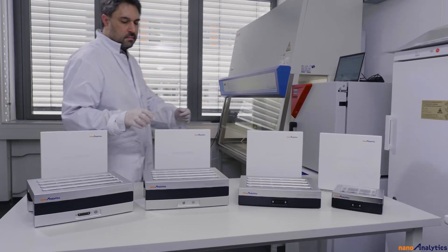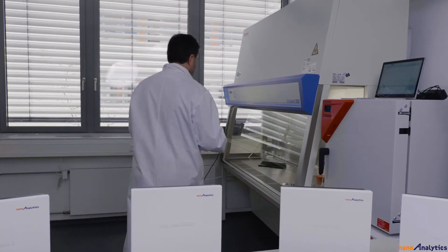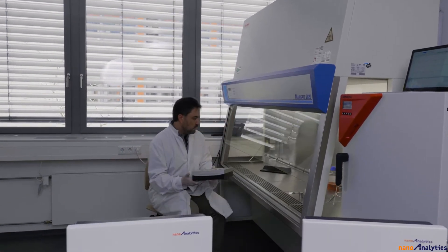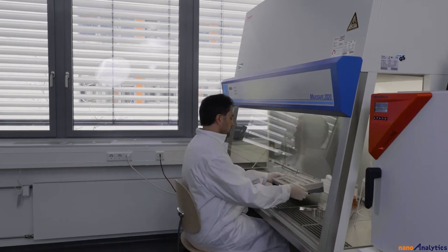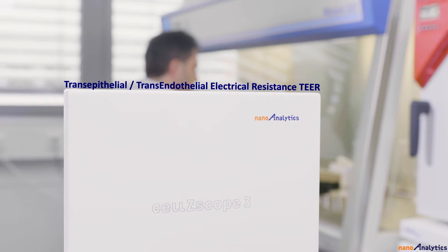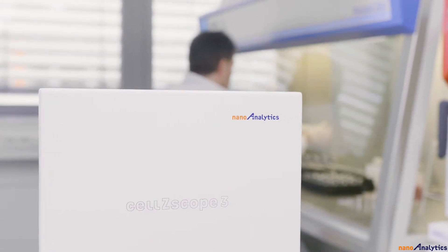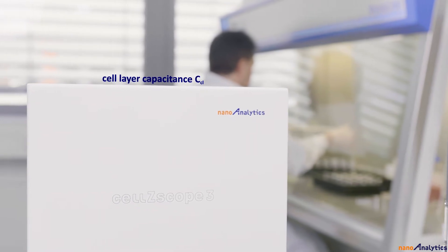The CellScope allows label-free monitoring of barrier-forming cells grown in standard culture inserts under physiological conditions. The trans-epithelial or trans-endothelial electric resistance and the cell layer capacitance are automatically recorded over hours, days, or even weeks.